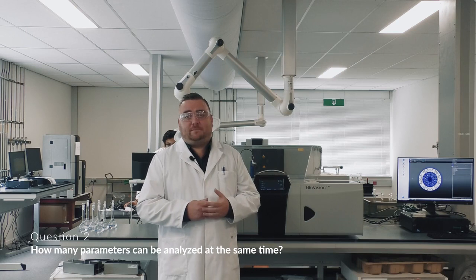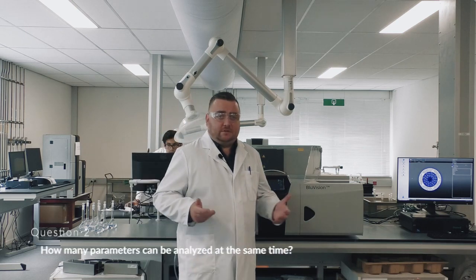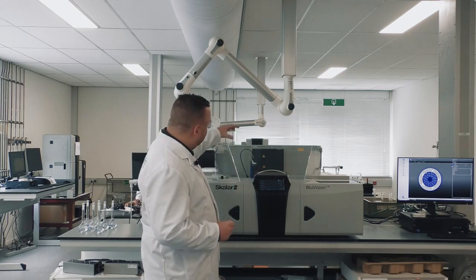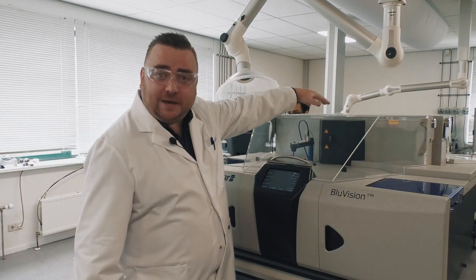Okay, so moving to question number 2, how many parameters can be analyzed at the same time? So the answer to that question is actually a function of the available filters for a particular measurement. The filters are actually housed on a filter wheel in this black housing at the back of the analyzer, where you have positions for 8 wavelength filters.